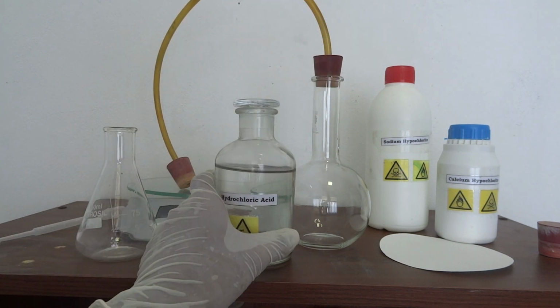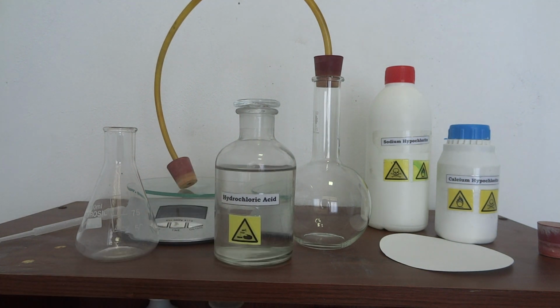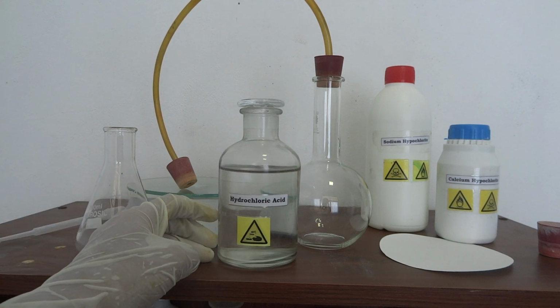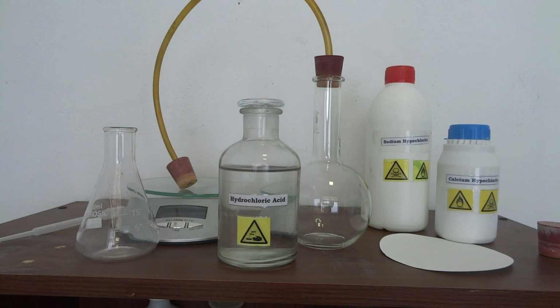I should really put on my respirator because this hydrochloric acid releases a crazy amount of hydrogen chloride gas, because it is more than 35% concentrated. Okay, so with the respirator on, we'll continue.